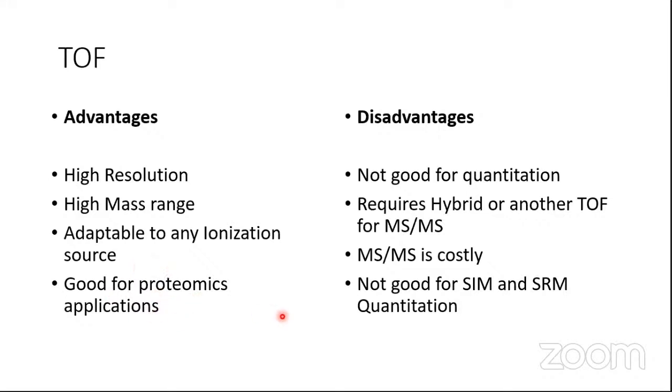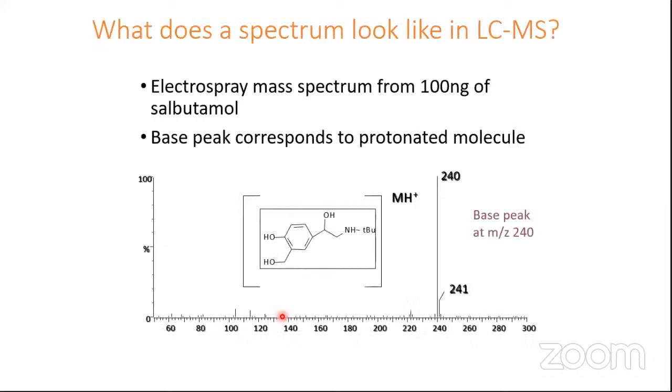Okay. Now we'll go to another area which I have to complete before I complete my talk. LCMS: all the techniques like electrospray, atmospheric pressure chemical ionization, atmospheric pressure photoionization, all are soft ionization techniques. That means you do not get fragments.